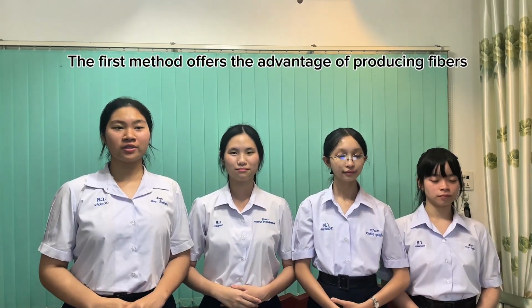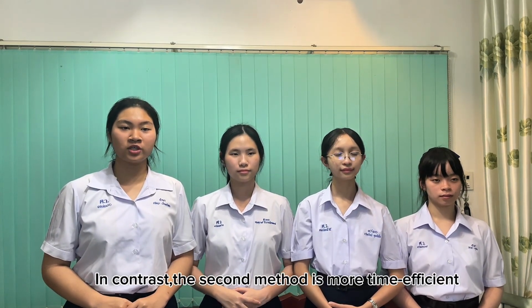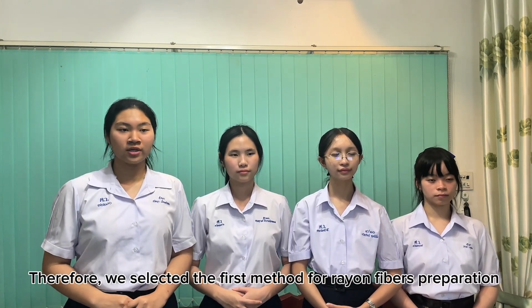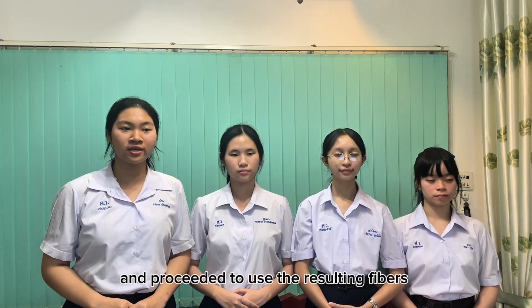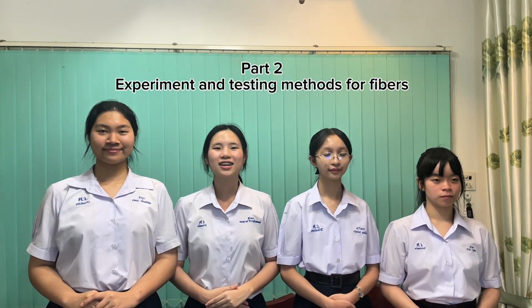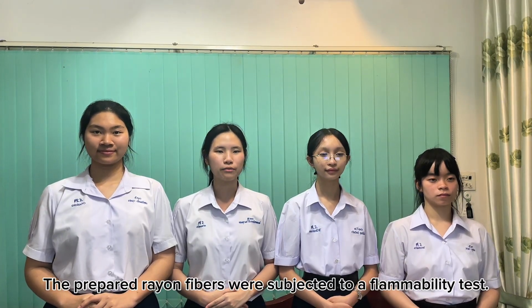The first method offers the advantage of producing fibers with higher purity than the second method. In contrast, the second method is more time efficient and requires fewer procedural steps. Therefore, we selected the first method for rayon fiber preparation and proceeded to use the resulting fibers in the subsequent experiment. Part 2. Experiment. Testing method for the fibers. First, flammability test of rayon fibers. The prepared rayon fibers were subjected to a flammability test.